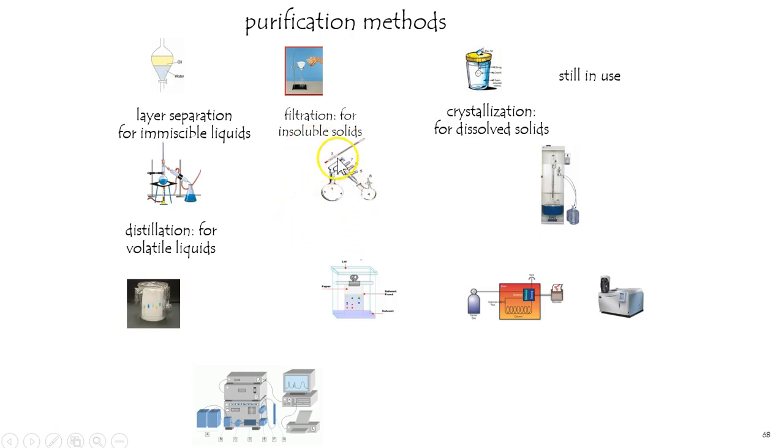Position number three has your thermometer in it, so you can conveniently record the boiling point, rendering this not only a separation technique, but also an identification technique, since you will get a boiling point as you go, if it's efficient enough. Water goes in, position 6, and water goes out, position 7. And this is simply an exterior jacket known as a condenser, since this renders the inner tube nice and cool so that it can condense, turn that boiled gas back into a liquid.